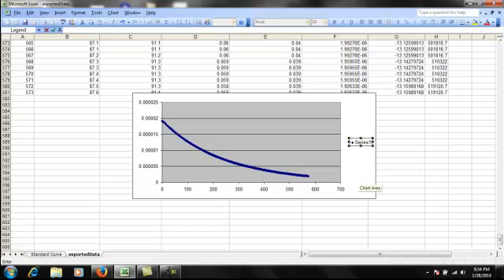So I wish you all luck in doing this. Really only one person from your group needs to do the Excel graphs, but I would like you to include with your lab report a copy of each of the graphs so that you can justify the order of the reaction with respect to crystal violet. If you have any questions about how to do this specifically, or you need help, do come and talk to me, and I will be happy to be of assistance.